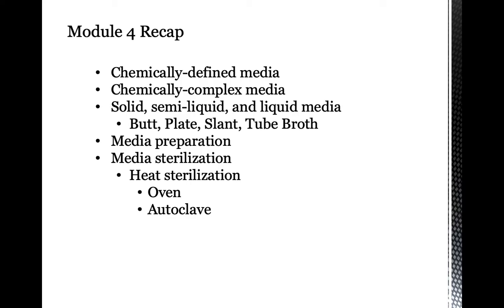For 1 liter or 1,000 milliliters of our culture medium, you just have to do ratio and proportion to identify the components of the medium, or, for the case of compounding, or if you prepared a lyophilized one, the total weight. Okay? And then lastly, I've mentioned media sterilization.